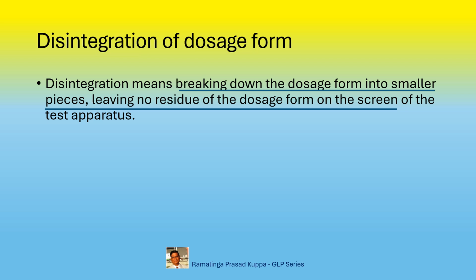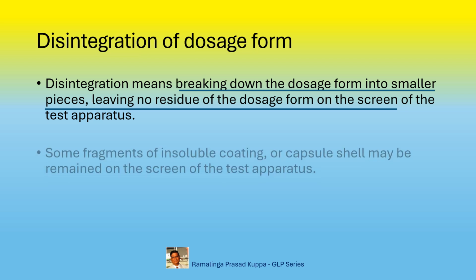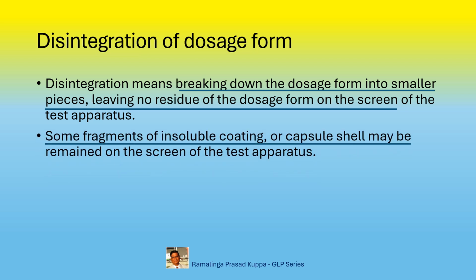So, after the test is performed, there should not be any palpable particles of the tablet left over on the screen. Some fragments of insoluble coating or capsule shell may remain on the screen of the test apparatus. So, a small amount of such remnants may be left over on the screen after the test.